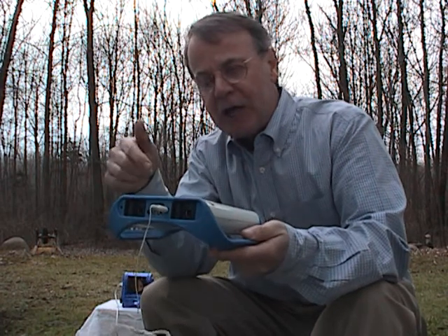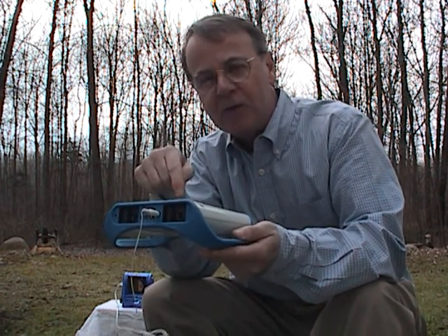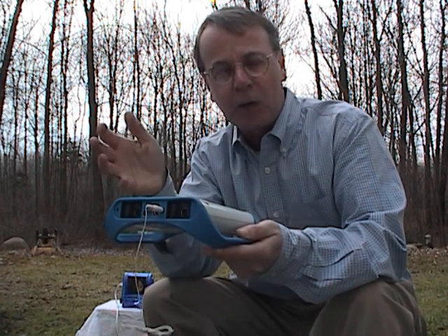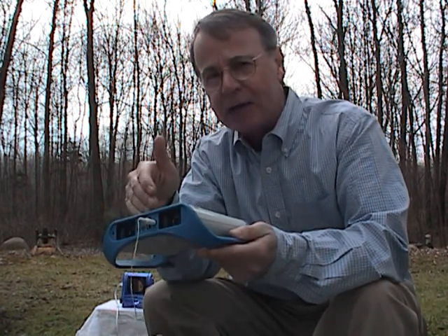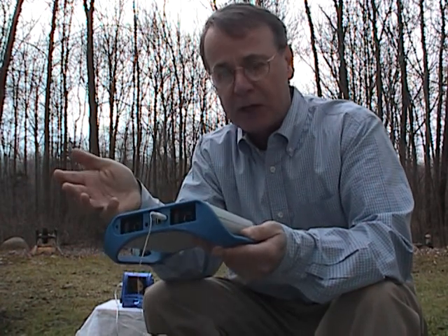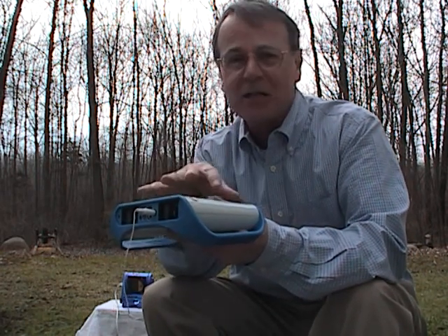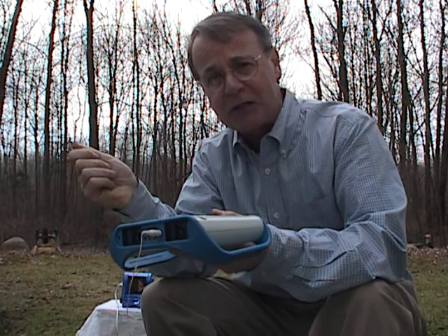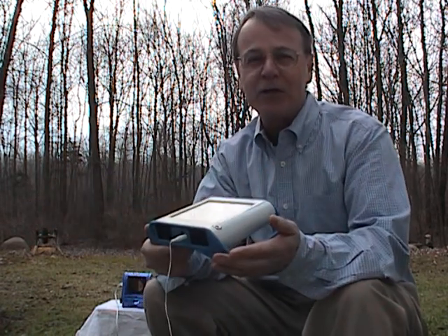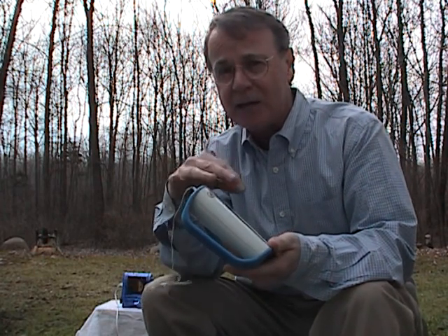What's really cool is it's actually saving that information. I can change the way I'm viewing the information — I can see it in different forms, which is nice for kids to play around with data. You can save it for later as well. Bring it back in the classroom and you don't lose anything. If there's a notebook you're using and writing things down, sometimes you lose things that way. This is not going to lose any of the data you're collecting outside, especially if you're going on a field trip. I like the idea that students can play with the data on this machine.